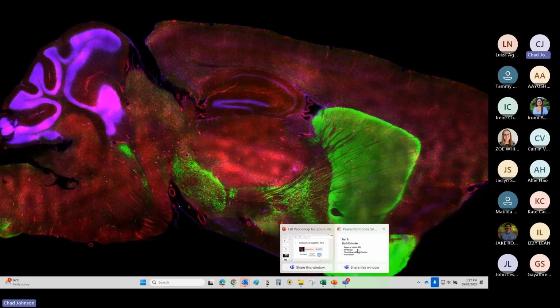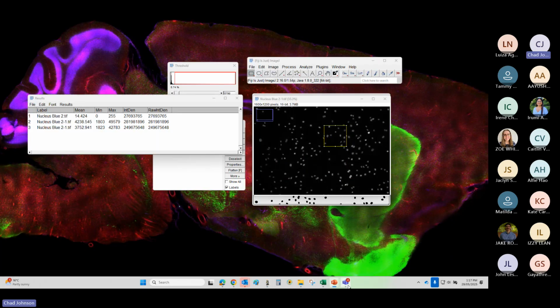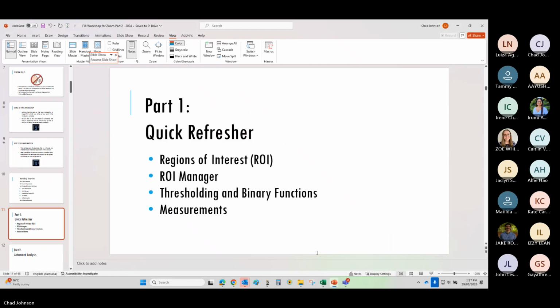All right. So very, very basic overview there. I have to do it this way because Teams doesn't let me isolate areas and move it around like Zoom does.